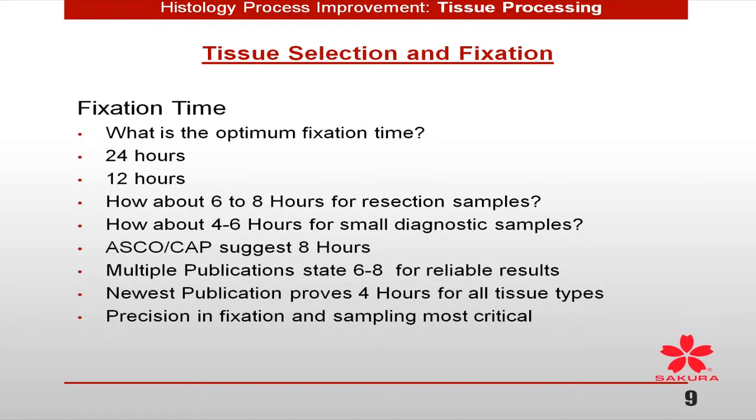But you do always have to make sure that you follow all your ASCO-CAP guidelines, and any other product that you have that has a specific specification and suggested times. You must follow those to remain compliant or do a validation study outside of that. But most publications out there will state that 6 to 8 hours for a reliable result.